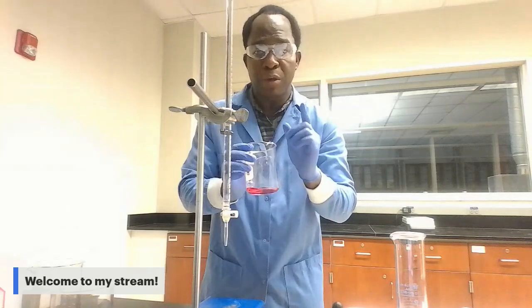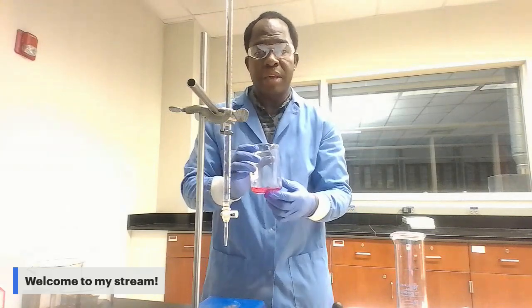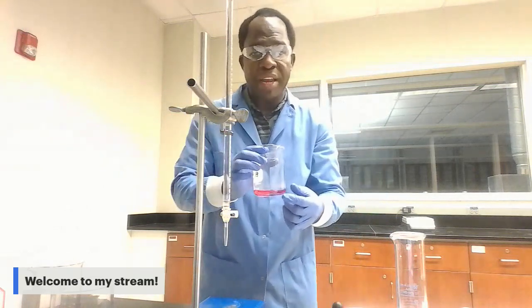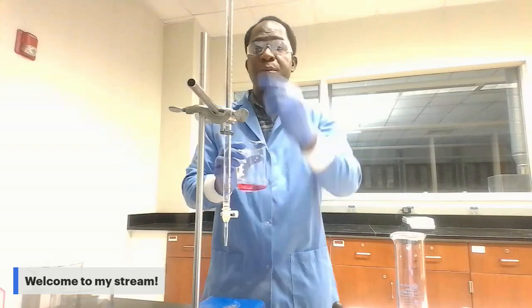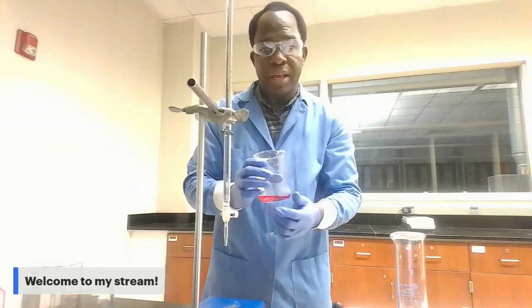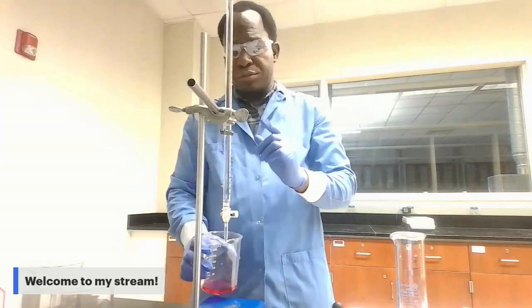When you get to equivalence, the color will change to clear. It means that all the OH minus ion has been cancelled by the H plus ion coming from the hydrochloric acid solution. Okay, this is what we are going to do.